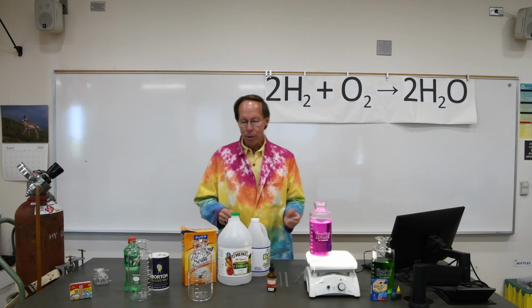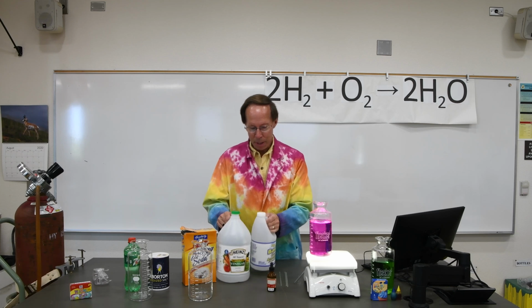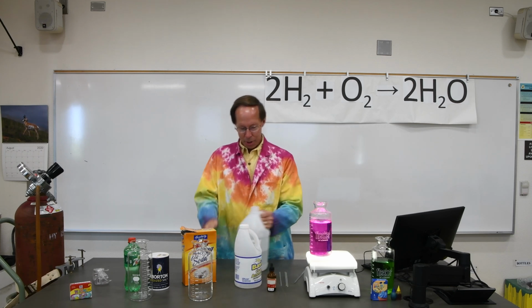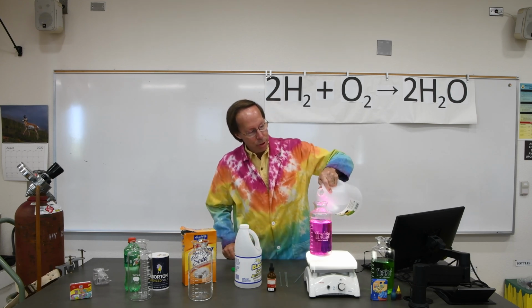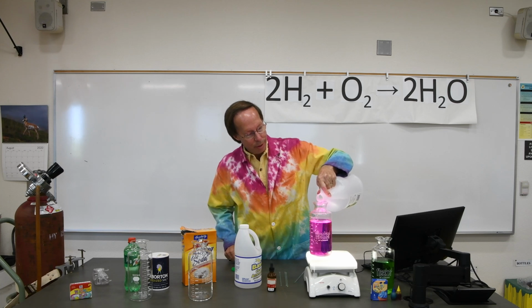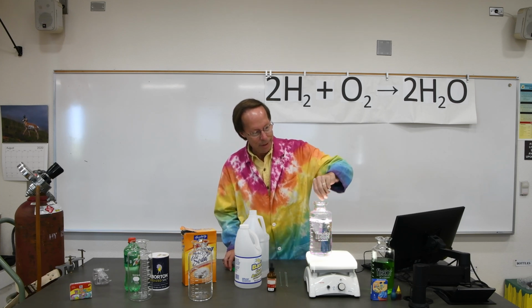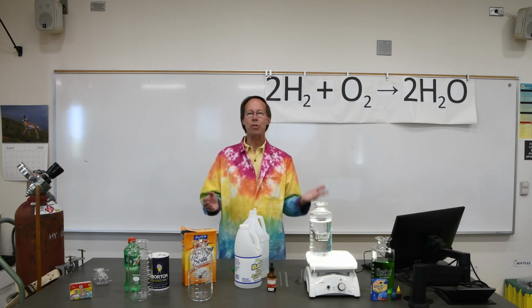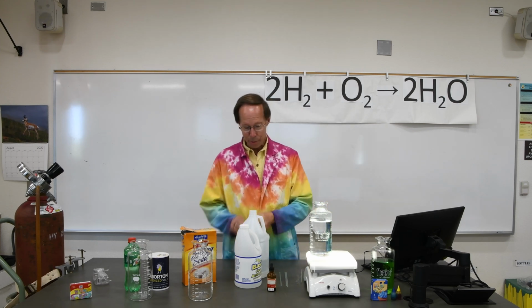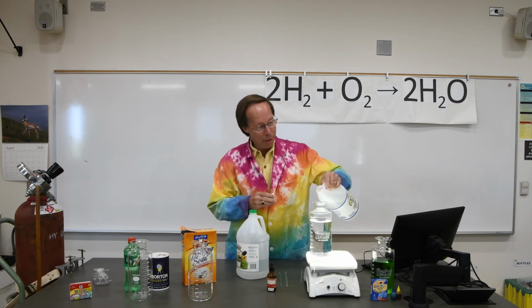Now, interestingly enough, although people don't often realize this, chemical changes are reversible. You can make them go in reverse. I'm going to take a little bit of vinegar, which is an acid, and we'll add that to our solution to convert the basic solution to an acidic solution. That looks like it might be enough. Let's find out here. And lo and behold, look at that. The phenolphthalein is reverted back to its acidic form. Color change, another chemical change. We could keep doing this over and over again. I can add some ammonia back to it again.